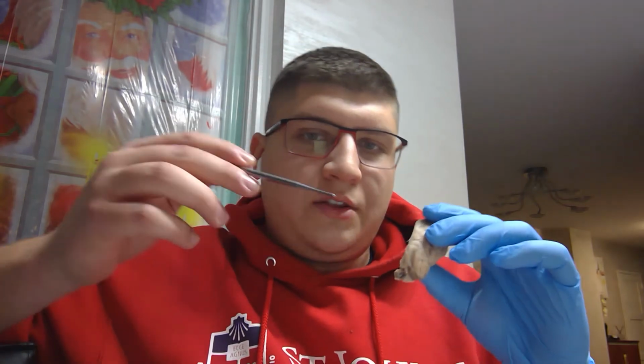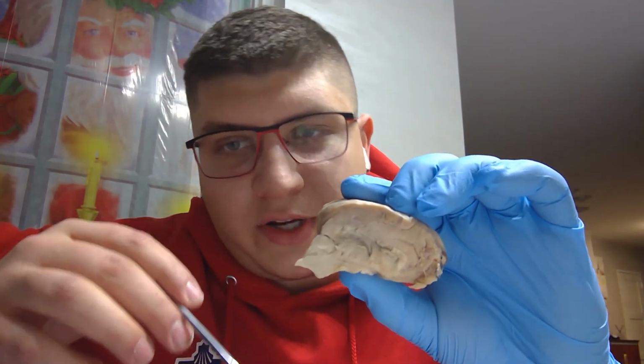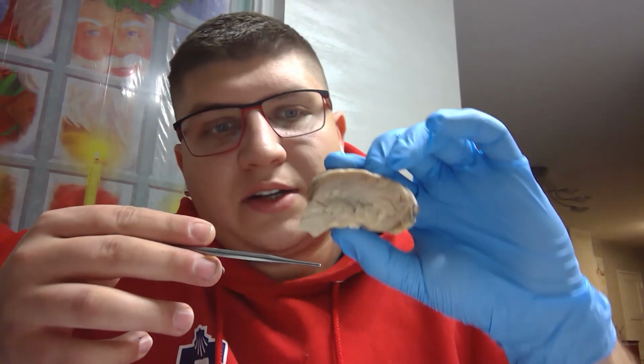Another part you're going to need to know is the cerebral cortex, which refers to more or less the majority of the brain: the frontal lobe, the parietal lobe, the occipitals, the temporals, more so the brain. If you look closely, there's always white matter and gray matter. You can differentiate it just by looking at it.